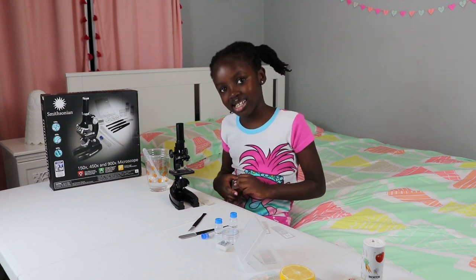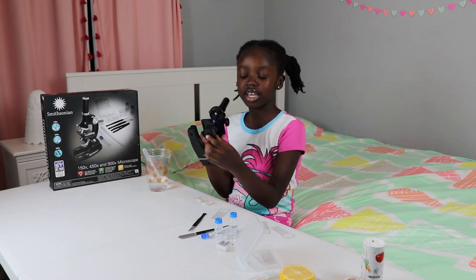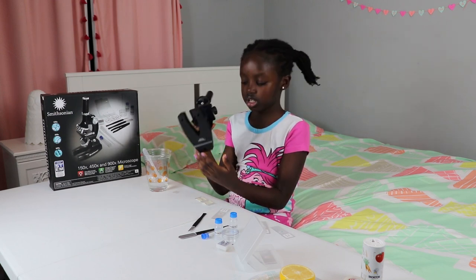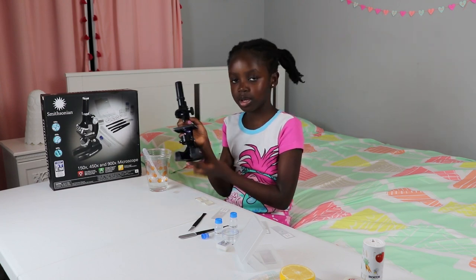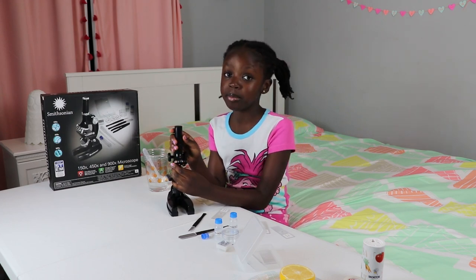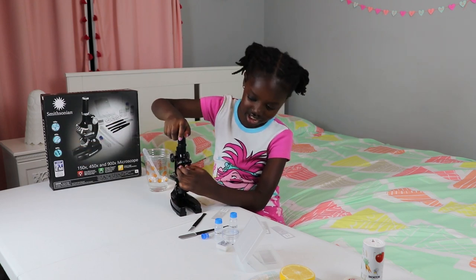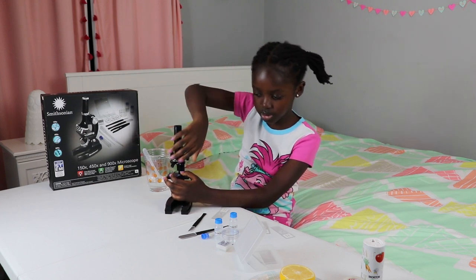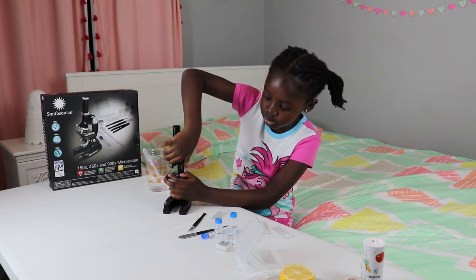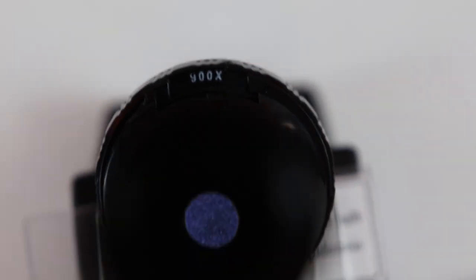To put the batteries in, you have to look at the bottom — there are screws there. You have to unscrew them and then put in the AA batteries. Also, to change your magnification, you just twist this dial right here. You twist it and it'll make a click when it's at that setting. And then when you look up here, it says how much magnification you are at.